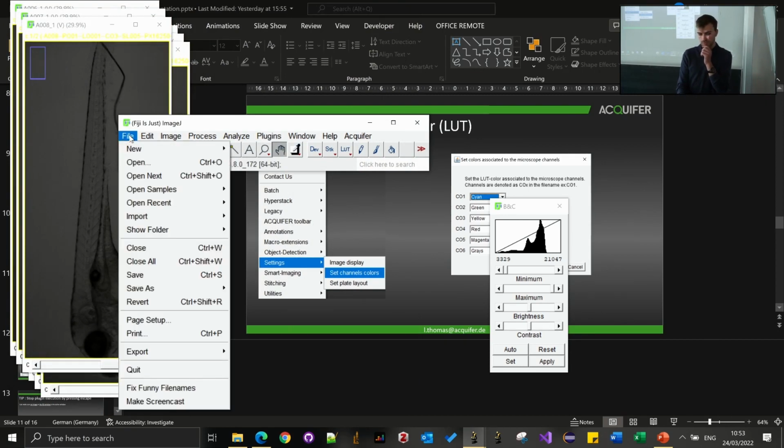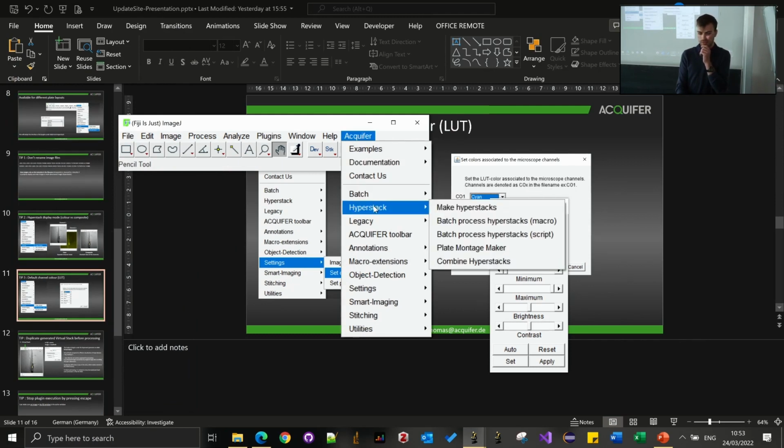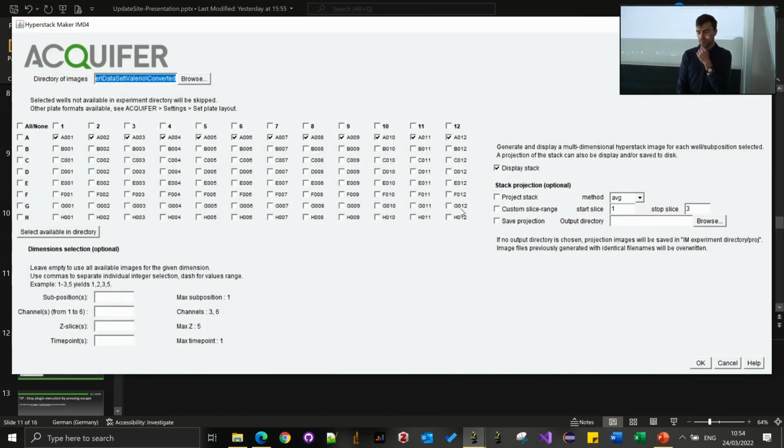But in the original data, the scale is set, right? Normally, yes. So it would make sense if it's the cropping that fixed it, right? Yes. Or maybe it's just... Why is it not? Yeah, I will check that. That's a good question.